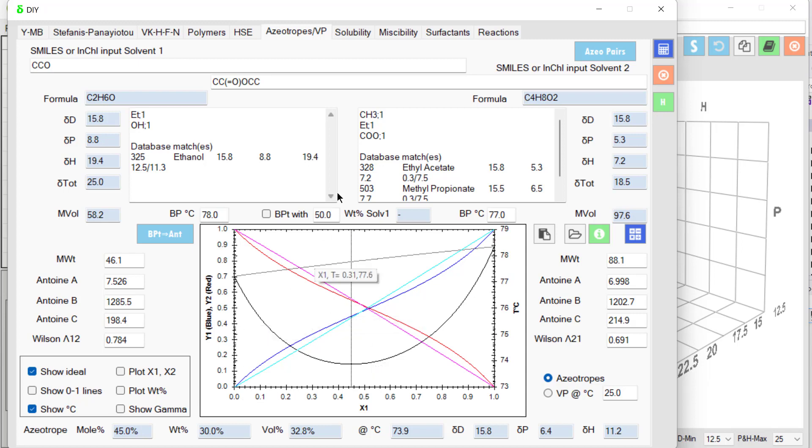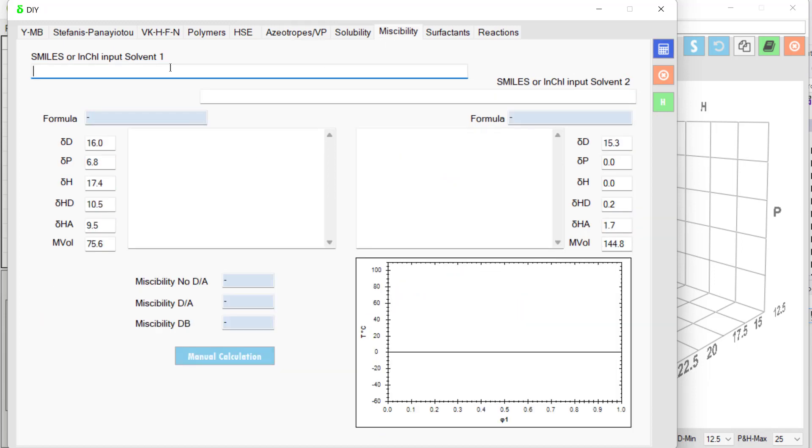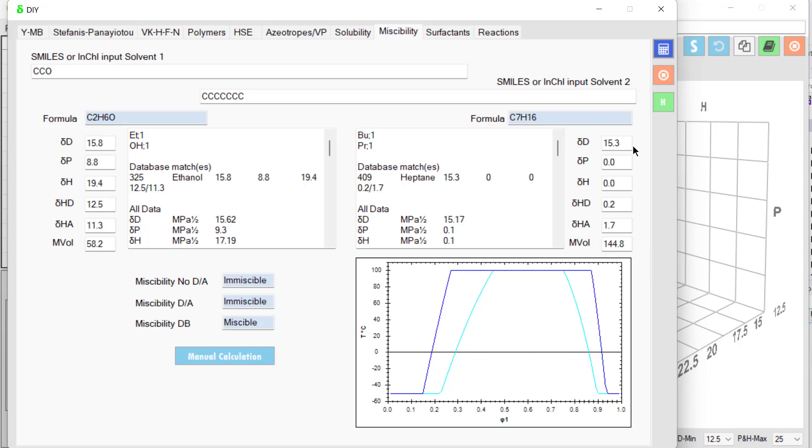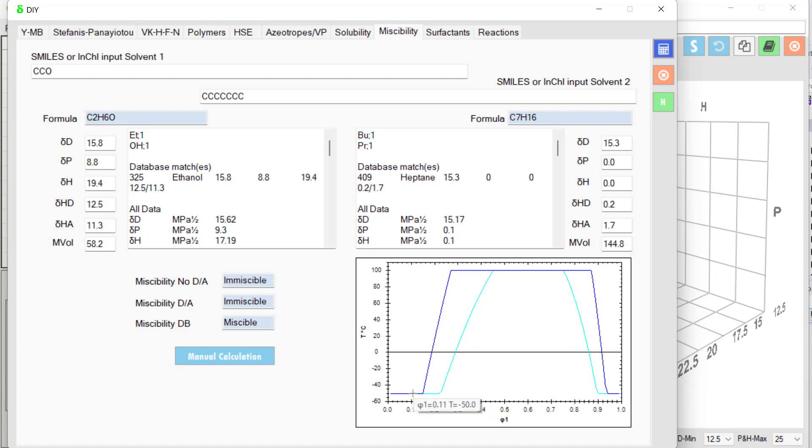What about miscibility? I'll try ethanol again. CCO. And heptane. 1, 2, 3, 4, 5, 6, 7. And it does a complex calculation of temperature effects. So at very low ratios or very high ratios, they're miscible. But in intermediate ratios, they're calculated as being immiscible.